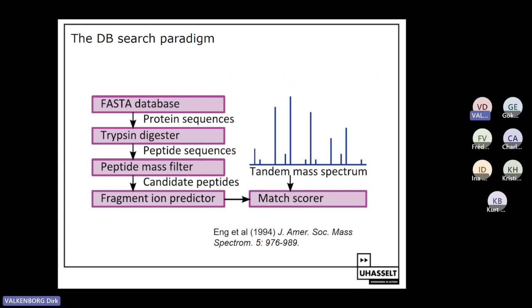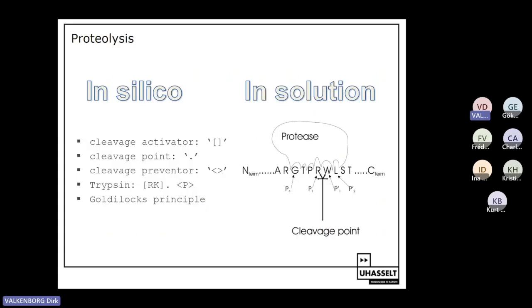So don't worry if you don't understand all these steps I just mentioned. I will go over them individually in the next slides. So first of all, we need to do proteolysis, or cut our protein with proteases.